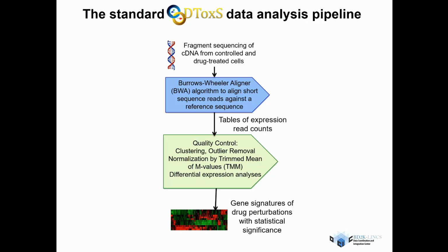So most of the computation is actually in this earlier step of the alignment. I found that on our computer, a 6-core computer, it took about 15 hours to do. The second part only took a few minutes.